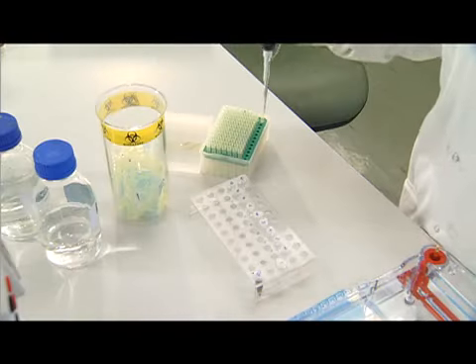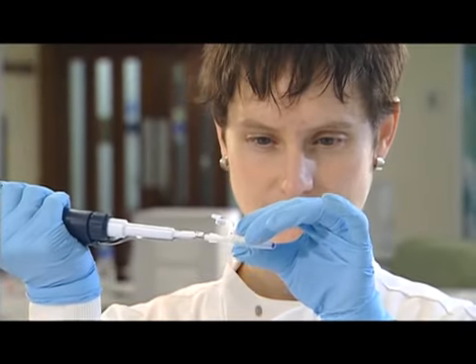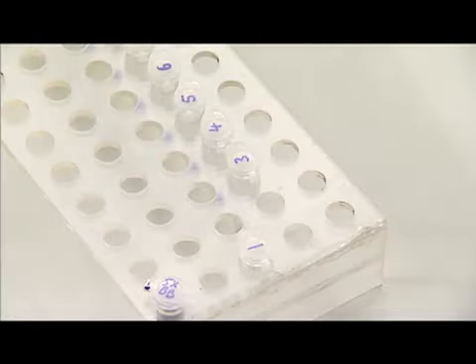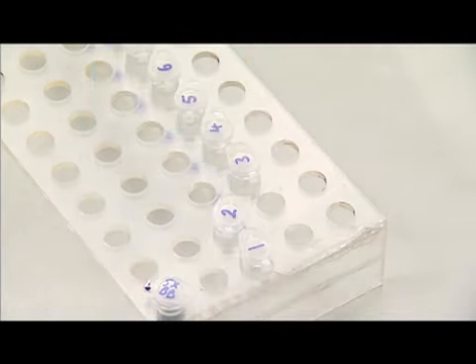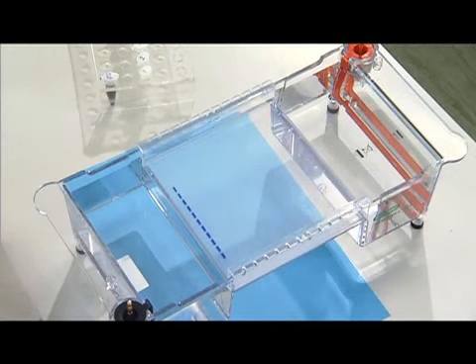Slowly and gently load the sample into the gel, being careful not to blow air into the well once the sample's been expelled. Each time a new sample is loaded, use a new tip. When you've taken up a sample, move the tube it came from so you can keep track of where you are. Load the sample into the next well. When you've finished loading the samples, don't move the gel tank. This could knock the samples out of the well, causing sample contamination.